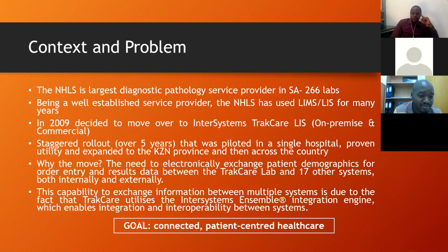So NHLS has used an LIS for a very long time. Actually, we could not even tell when we started using an LIS, but I'll take you through the transition that we went through in 2009, where we moved from one LIS to another. Currently we are using a commercial LIS called TrakCare LIS.